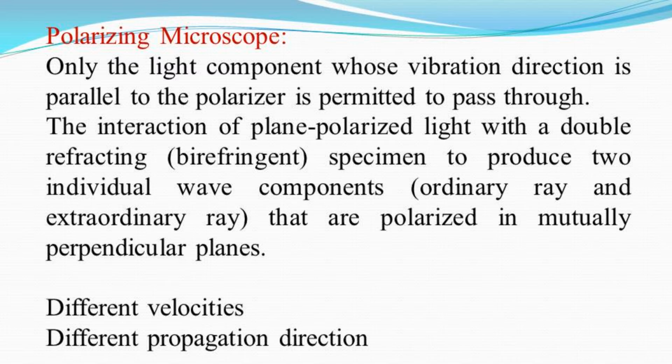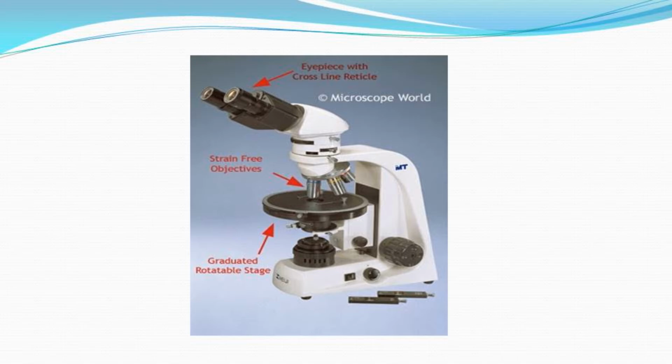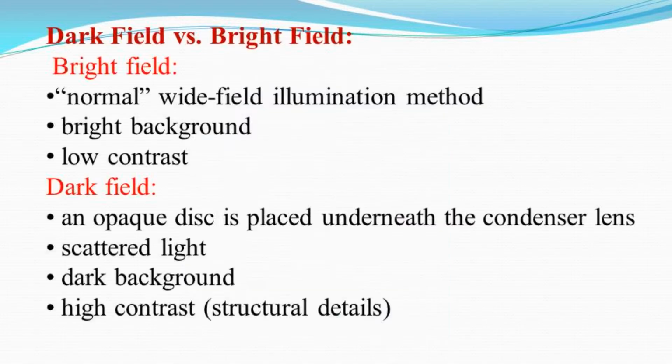These are polarized in mutually perpendicular planes. They have different velocities and different propagation directions. Image showing the polarizing microscope.